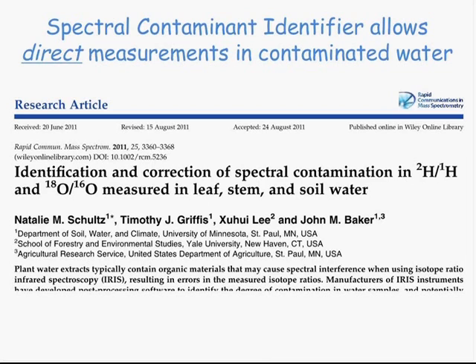Elena, please repeat the questions because we can't hear it from the phone. So the question was whether LGR is planning to offer an extractor as a peripheral to the instrument, and that is not something that we are planning to do right now. We are focusing on the other issues that I suggested.